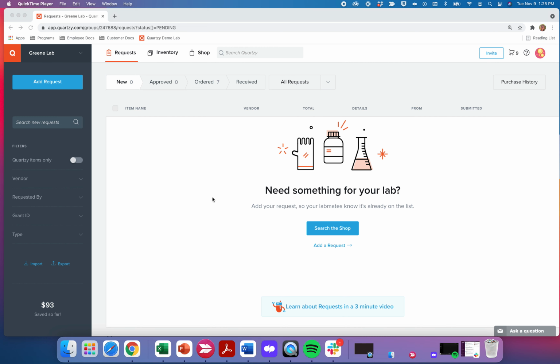Hi there, I'm Samantha Savage, a Customer Success Manager at Quartzy, and I'm going to walk you through the process of placing an order with Quartzy at University of North Carolina, Chapel Hill.